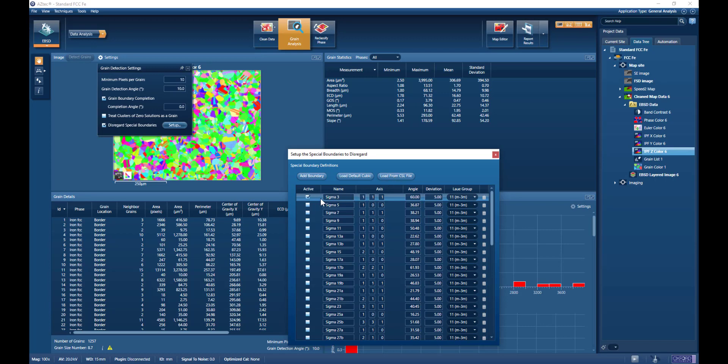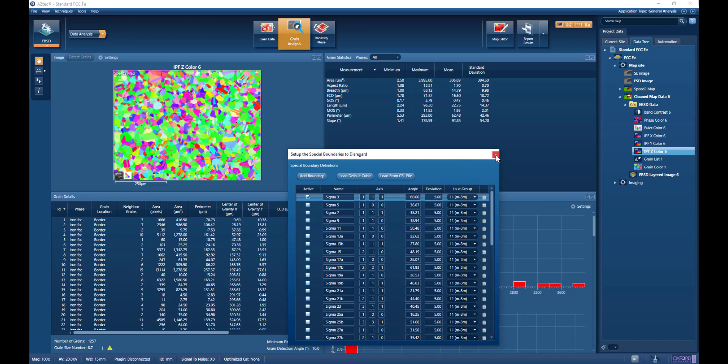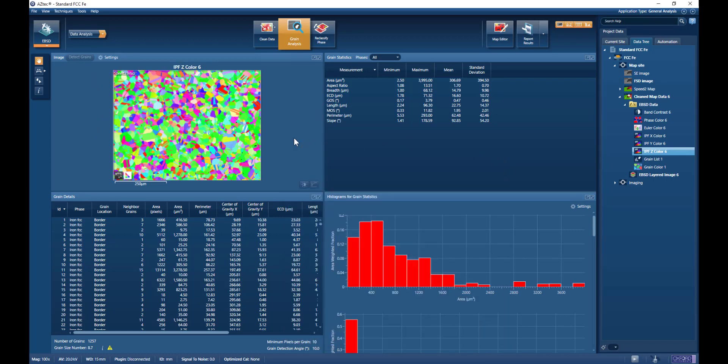what we've told it to do is to ignore the sigma 3 CSL boundaries. These are characterized by 60 degrees around 111 axis, and with a deviation of 5 degrees. So it's important in twinned materials that we exclude these special boundaries to give a true measure of the grain size.